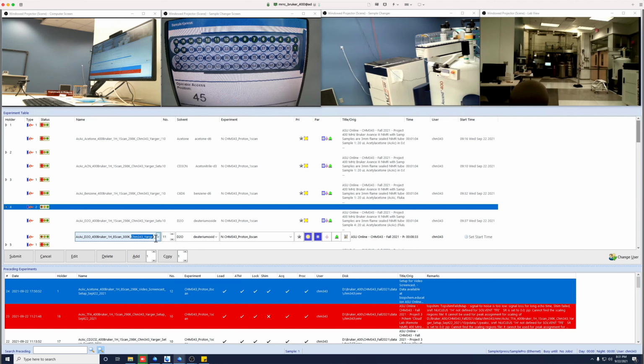This is some information about us. So this is part of a video screencast example. And we're doing this on September 22nd, 2021. It increments the experiment number.